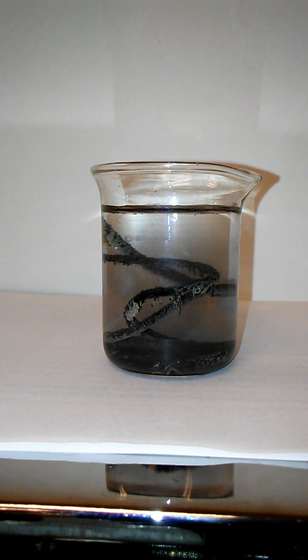So that's that one. Next period, we're doing the other combination. So here I did copper and silver, here I did iron and silver. Next period we're doing iron and copper. There's one other combination at least that could be done, but I'm not doing that one right now today. But watch the videos when I get them posted if you want to.